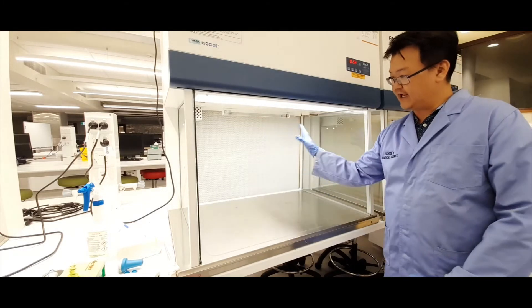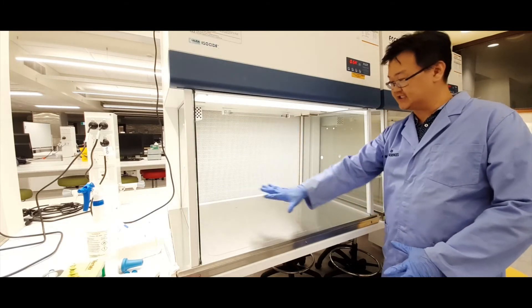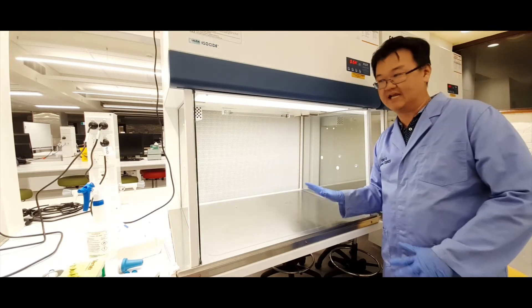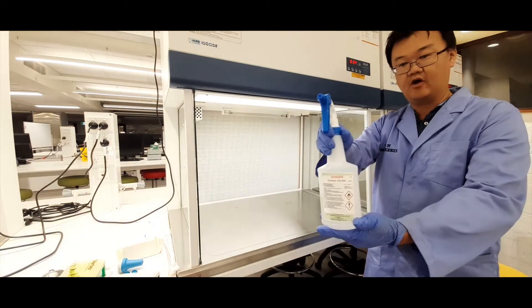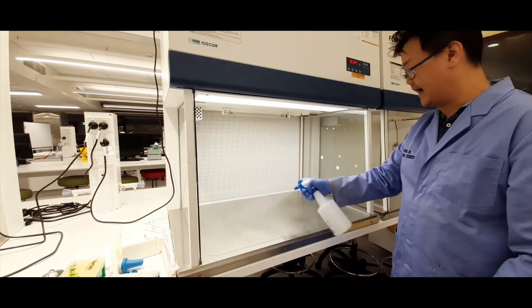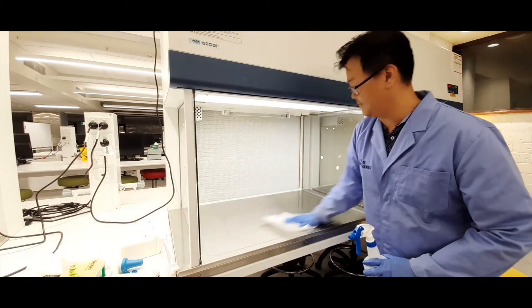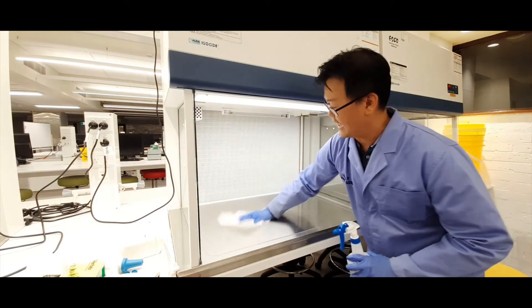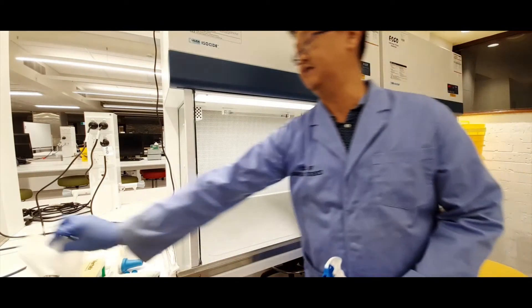Now, even though that UV light was sterilizing this environment, another good practice is to give this surface a spray with 70% ethanol. So I have a bottle of 70% ethanol here. It's good to just give that a spray, and then you get a piece of paper towel just to wipe it down. That's just an extra measure to clean and sterilize that work surface.